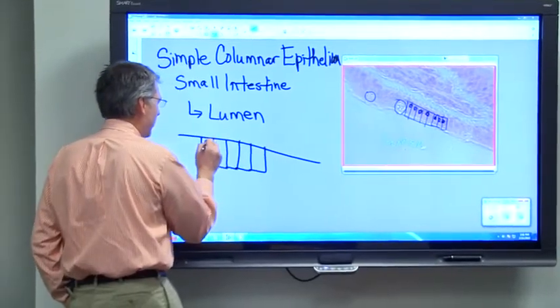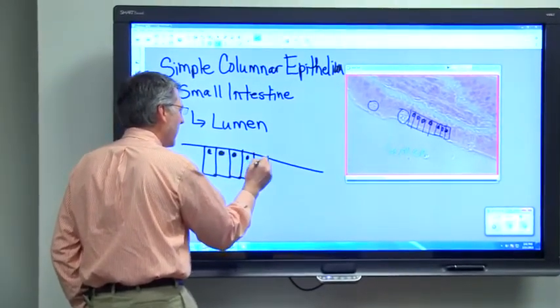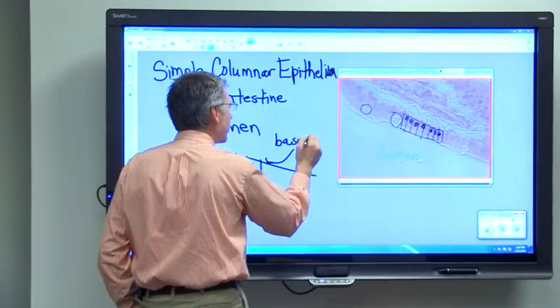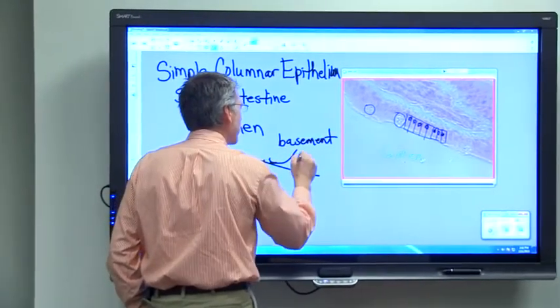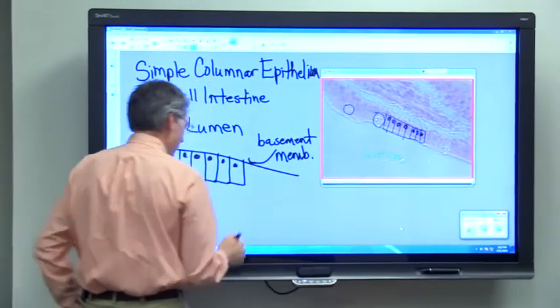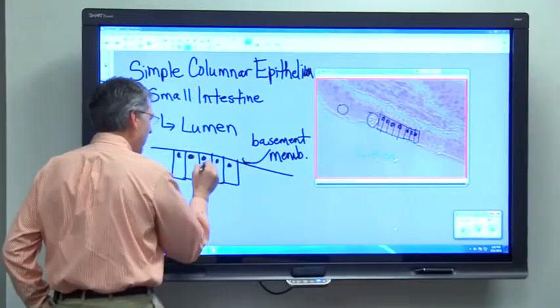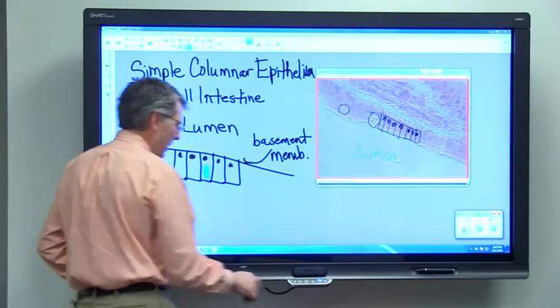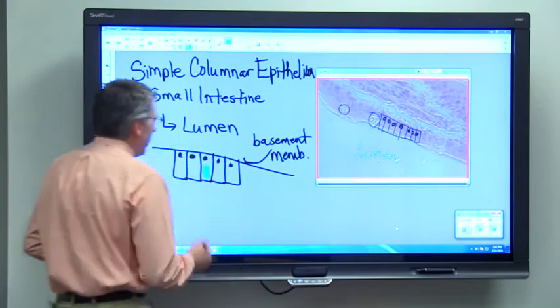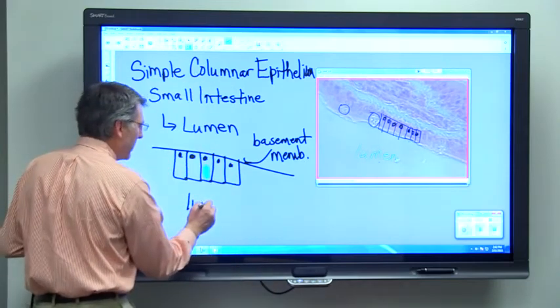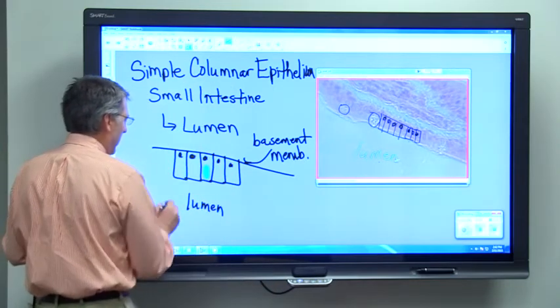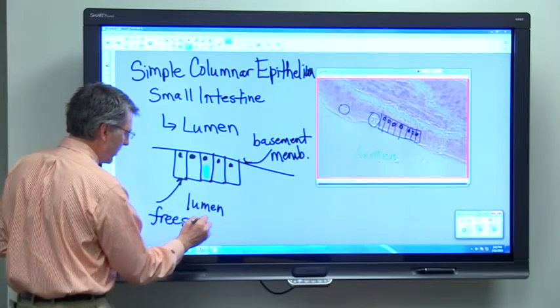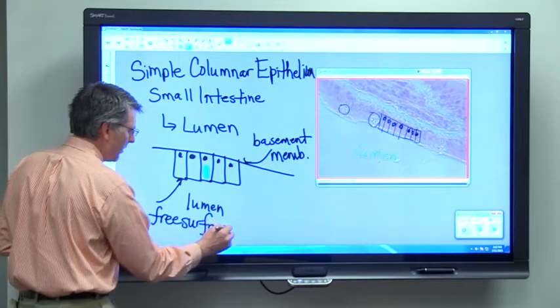We'll have nuclei all in the same level near the basement membrane. And then we'll have an occasional goblet cell. Now, this would be the lumen, so this is the free surface of the tissue.